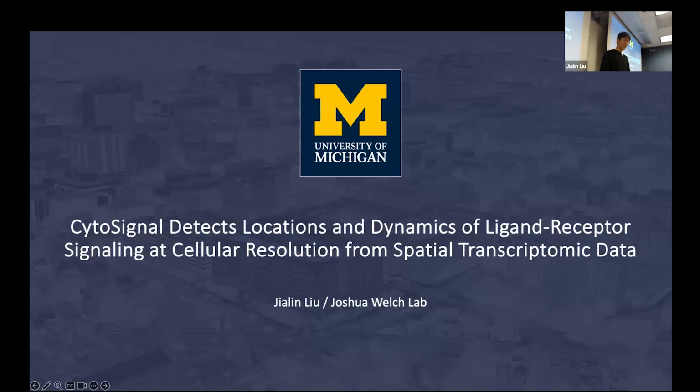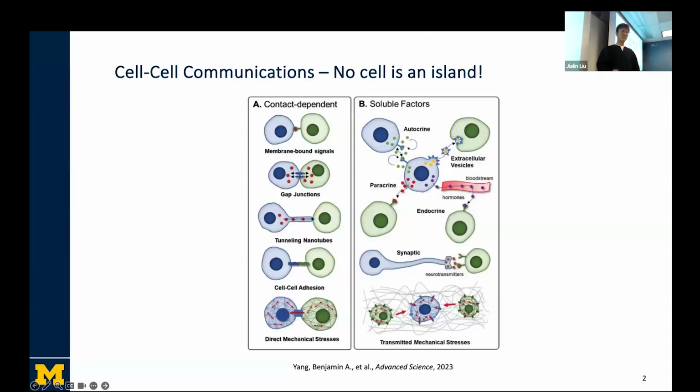So today I'll be talking a little bit about my project, which is to detect locations and dynamics of ligand-receptor signaling at cellular resolution from spatial transcriptomics. It is a really long topic, but I guess it states the main idea clearly: we do cell-cell communication, and it's from spatial transcriptomics. So let's start from the background.